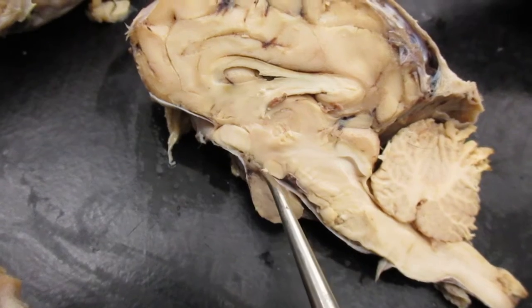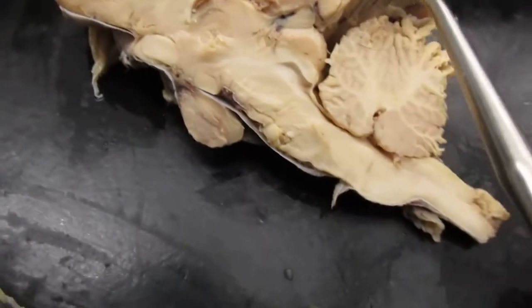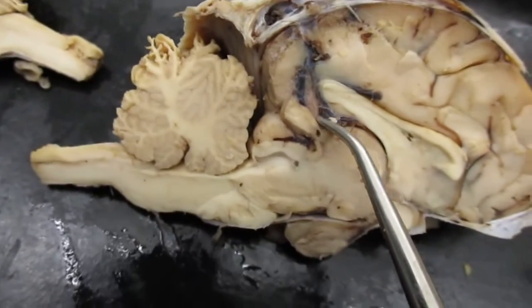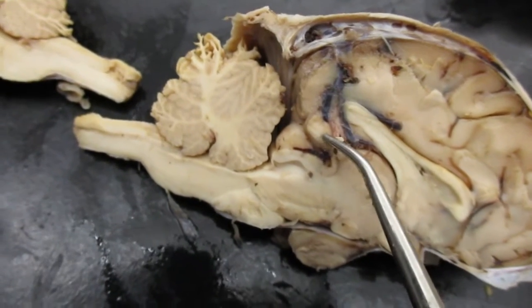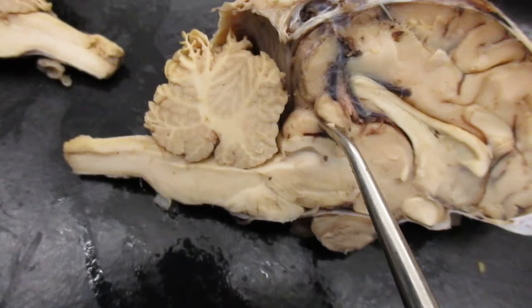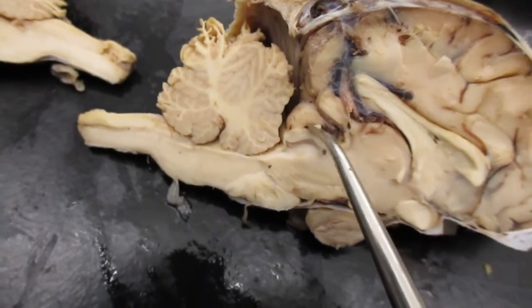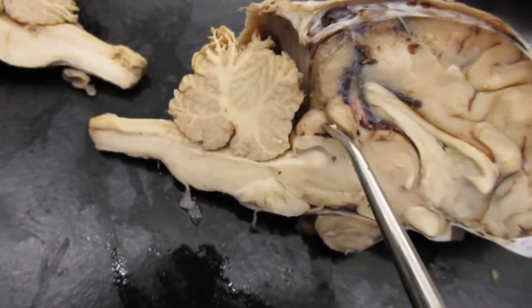hypothalamus, infundibulum, pituitary gland. There is a pineal body, or pineal gland, right here. Here it is more visible. Here's your pineal body or pineal gland right there. Now there's a structure called the corpora quadrigemina right here. Right there.